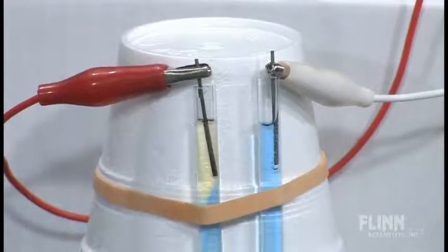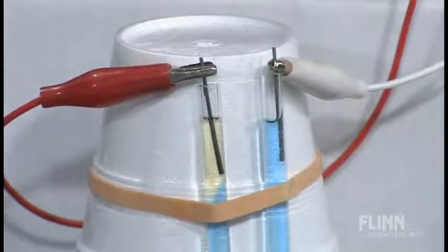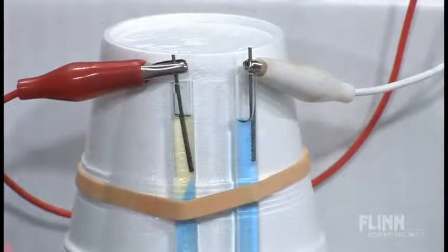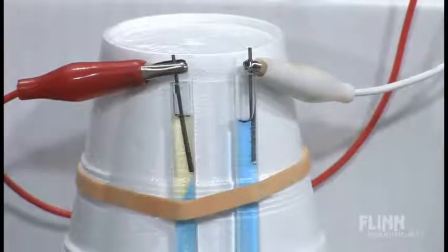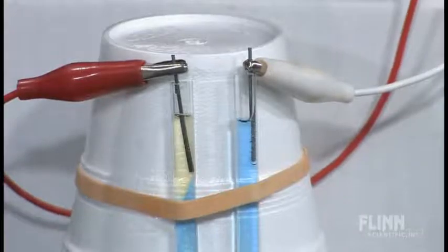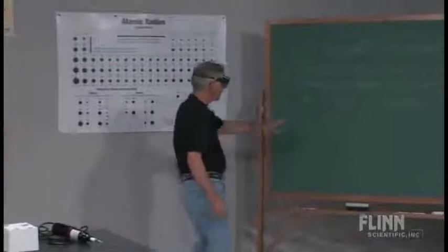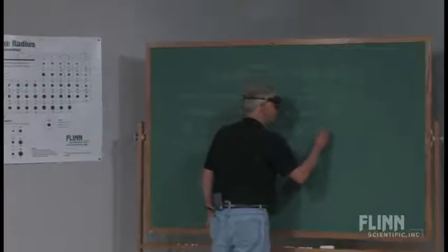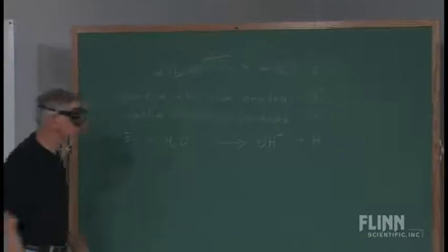Let's go back and make a couple more observations. Let's look at those bubbles that are coming off. That side's giving me a lot of really little bubbles, and they're coming very fast. Fewer bubbles, not as fast. H2O has hydrogen and oxygen. If the oxygen's in the hydroxide, then the gas must be hydrogen. But H isn't how we represent hydrogen, it's H2.